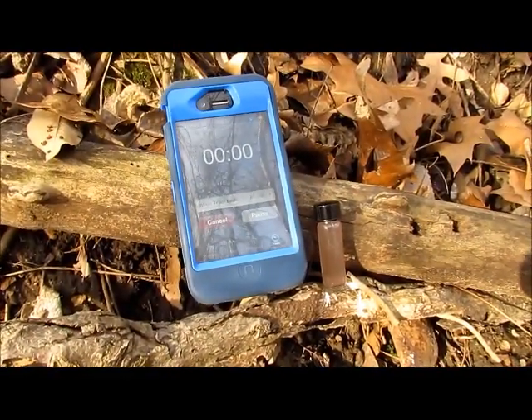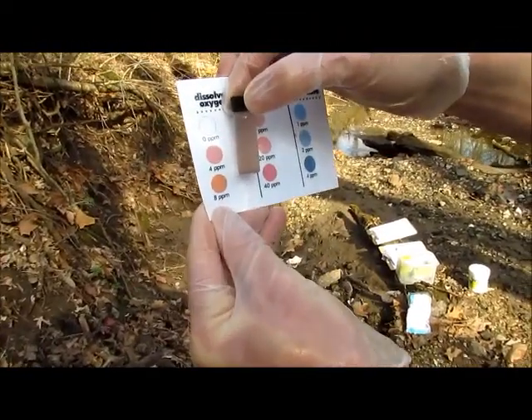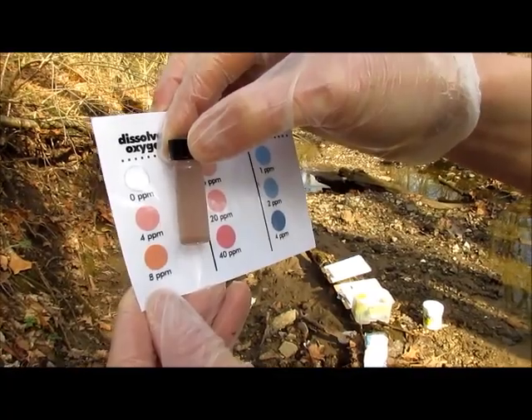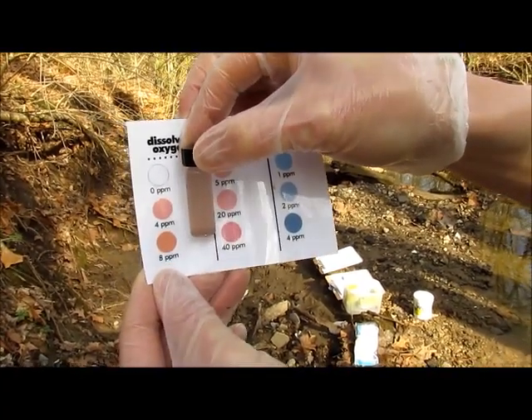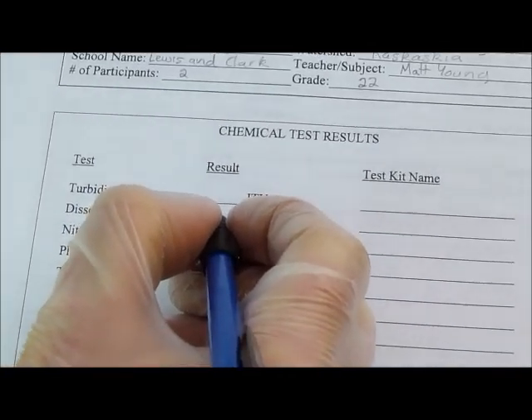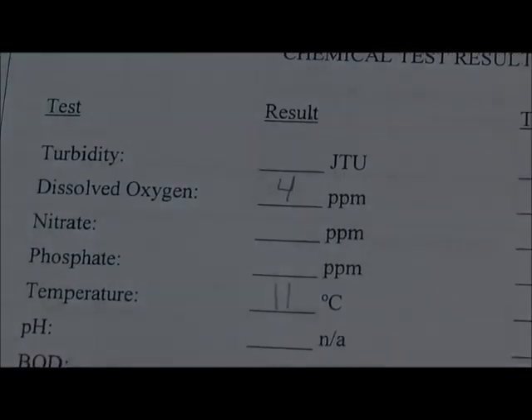After the five minutes is up, grab your test tube and compare it to the color chart included in your Lamont kit. The dissolved oxygen colors are on the left — you have zero, four, and eight parts per million. For this sample, it looks like it's closest to four. It may not be exact, but you're going for the one it's closest to, so you'll write down four parts per million on your datasheet.